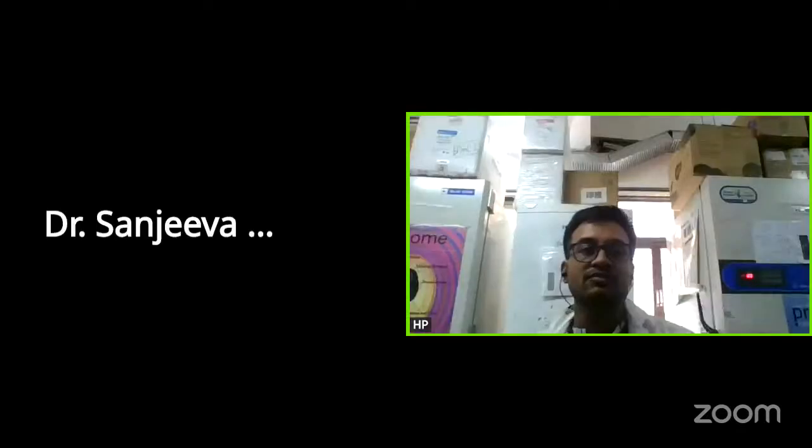Thank you, sir. Good morning, everyone. Now I'm going to show a few steps of microarray data analysis. I will mainly focus on protein arrays and SARS-CoV-2, the virus, and how we are using protein arrays for that. So let me share my screen.